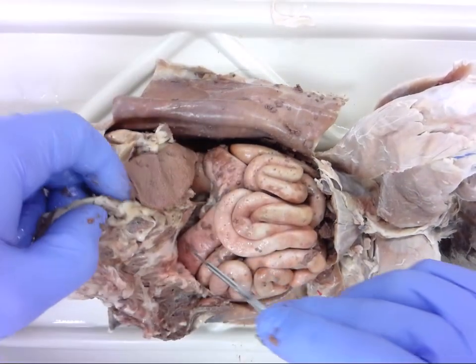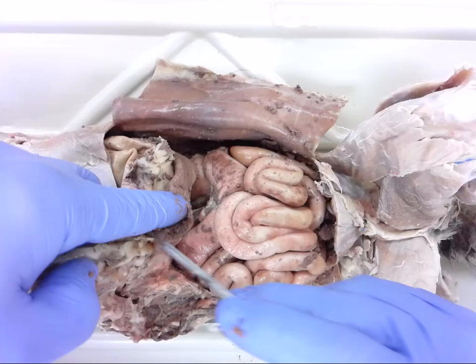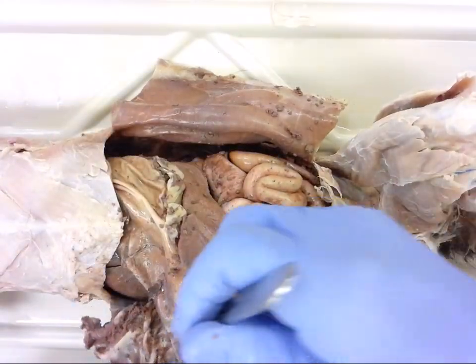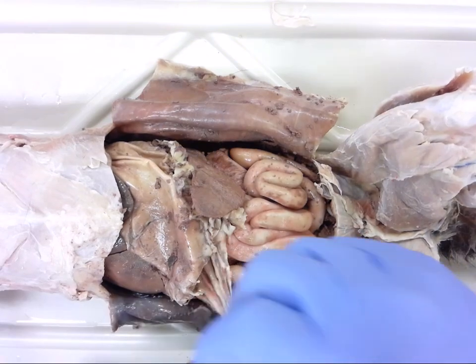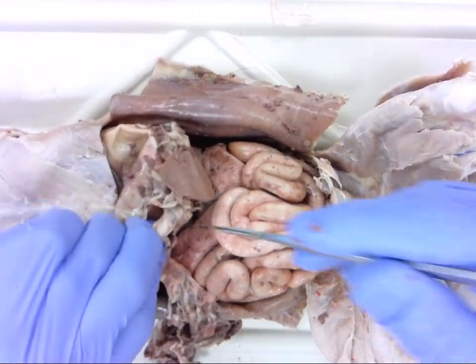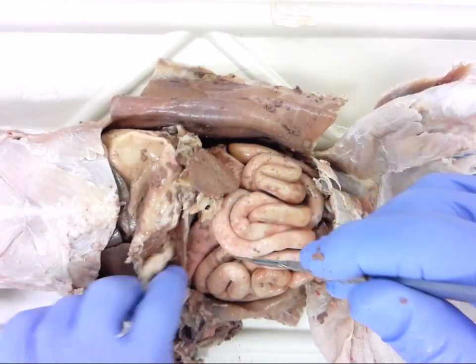So I will go ahead and see if I can get this out as intact as possible so that we can see the rest of the abdominal contents. So again, make sure you're looking at what it's attaching to, because once it's out, once it's gone, we can't really see what it was attached to.